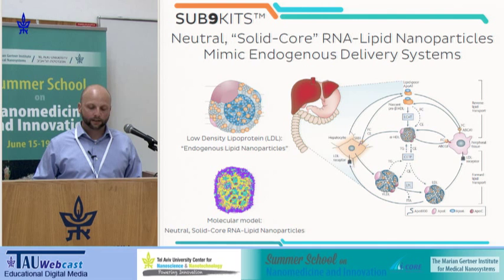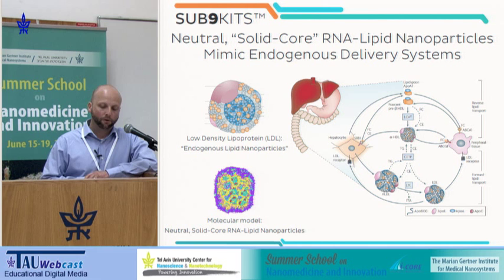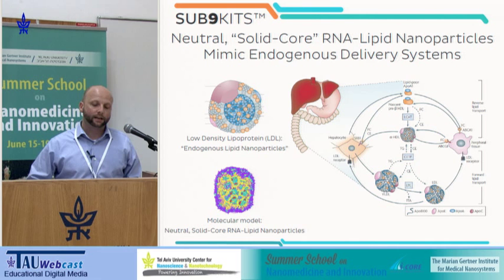With this, I've shown a molecular model of the types of nanoparticles we made, and this was done in Peter's lab and a collaborator of his, to really model the structure of these nanoparticles. Again, they're these solid core structures with the nucleic acid on the inside, and similarly to LDL and HDL particles, having an amphiphilic shell, in this case a lipid component and a PEG component on the outside.